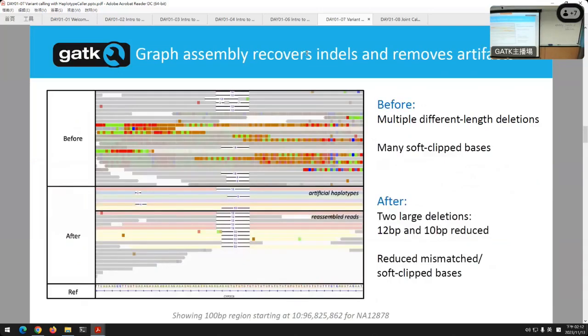All right, this is an example of why we don't trust BWA. BWA, again, was good, but this is why we don't. Let's look at the bottom and explain why. Look at the reference sequence. If you look carefully, you see AG, AG, AG, AG, TG, TG, TG, over and over again. This is exactly the case that sequencers do terribly on. Once it sees too many A's and G's or T's and G's, it starts to hallucinate and imagine the wrong bases. I don't know why, the chemistry starts to bleed and there are issues.